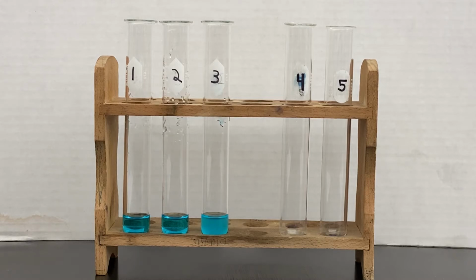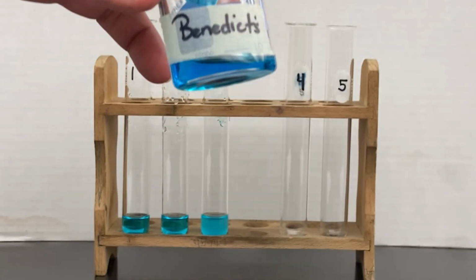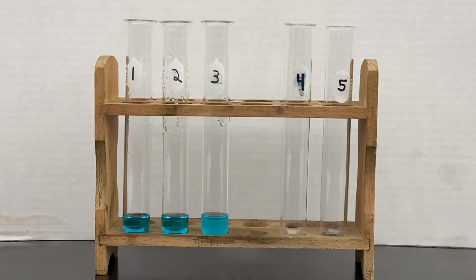Benedict's starts out as a very vibrant blue color, almost the color of Windex, or like a raspberry Kool-Aid drink. And it's going to react with one of the 3 carbohydrates that we learned about. In order for it to react, we have to heat it. So I'm going to heat it for 2 minutes in a hot water bath.